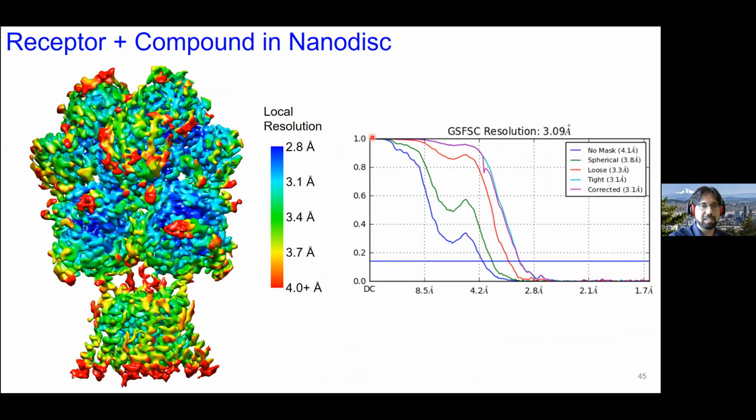But in terms of zinc, no, because these were obtained in the absence of zinc. I'm more interested in receptor activation, and that happens in the absence of zinc. So we were going away from that. But we did see density for the ligands at the ligand binding domain. So all 4 ligands we were seeing density for, so the glutamate and glycines.